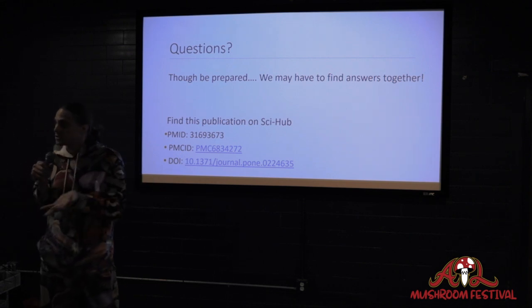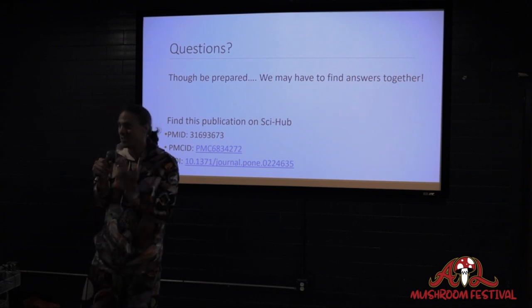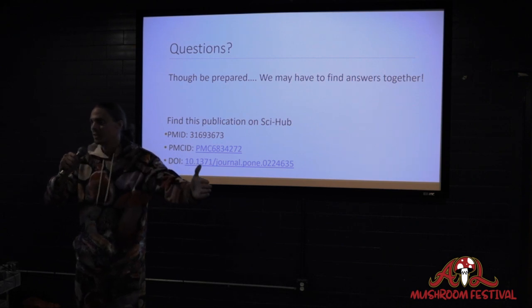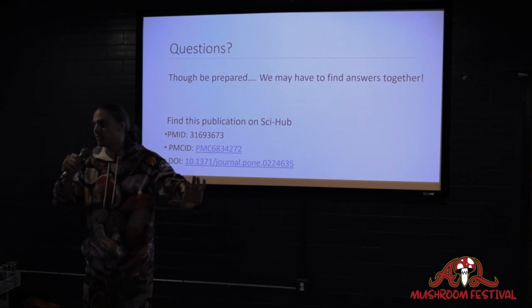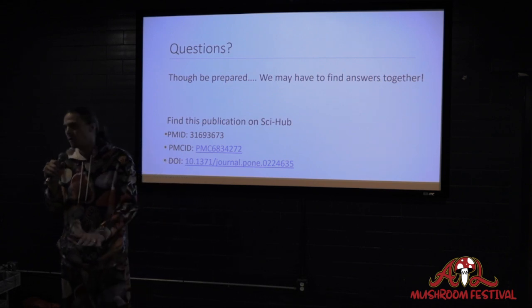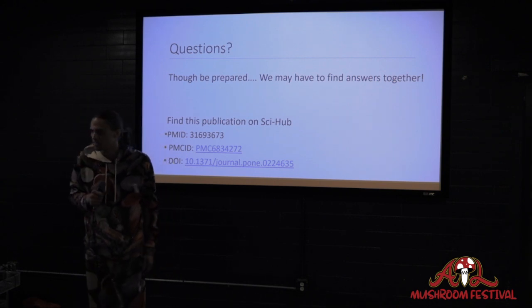And as long as it hasn't sporulated yet, which is why I encourage you to treat it like it's your child and you just watch it like a hawk, because before it turns a color, it's all mycelia, and you can run away from it. The second it turns a color, you've got problems. Not that you can't fix them, but it's just going to take more time. So I hope that answers your question.